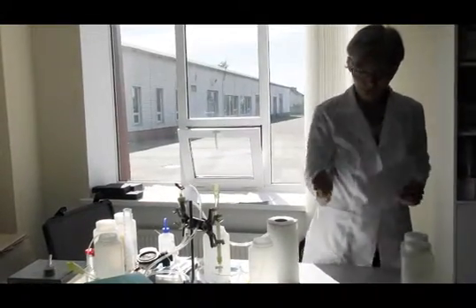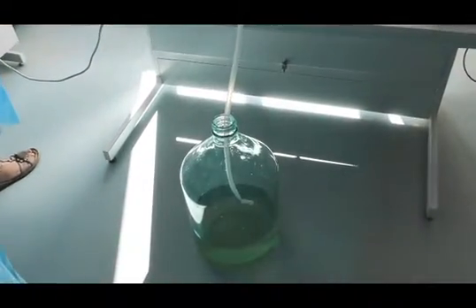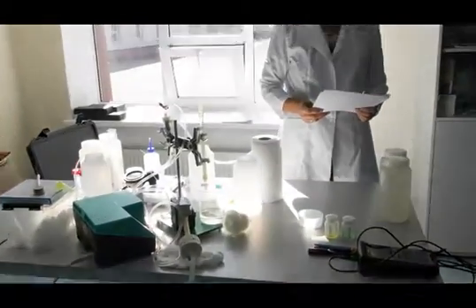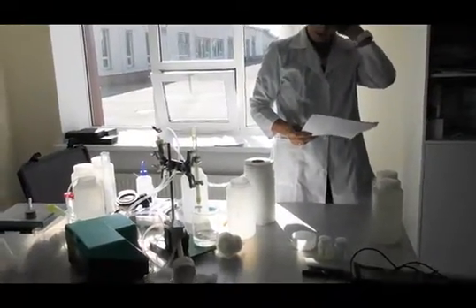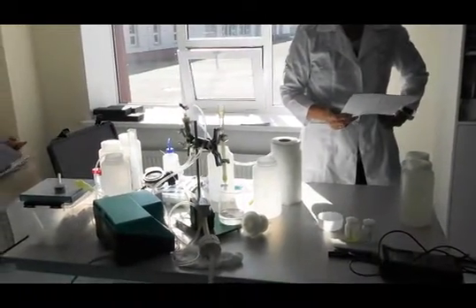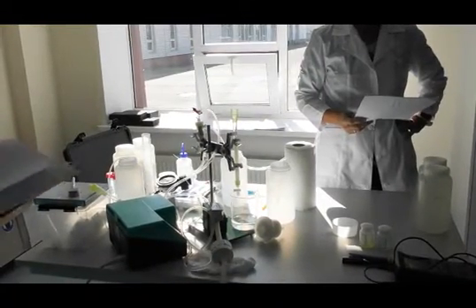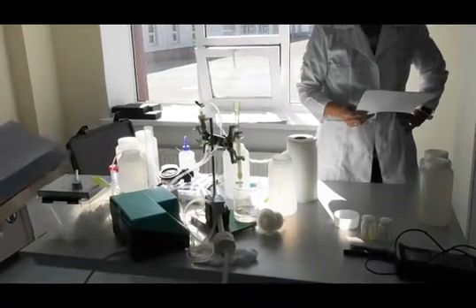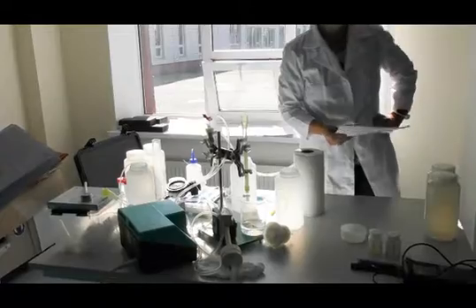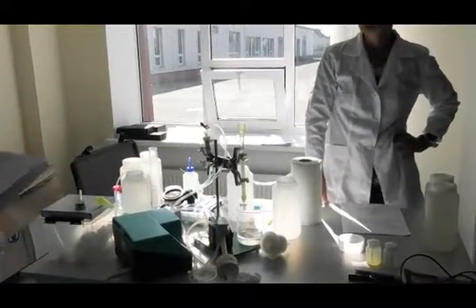I will demonstrate on the water you collected in the Chernobyl site. But first, water fractionation. The important thing to remember and to be aware of is that total concentration is information and it should be measured, but that gives no information about processes and mobility and bioavailability.